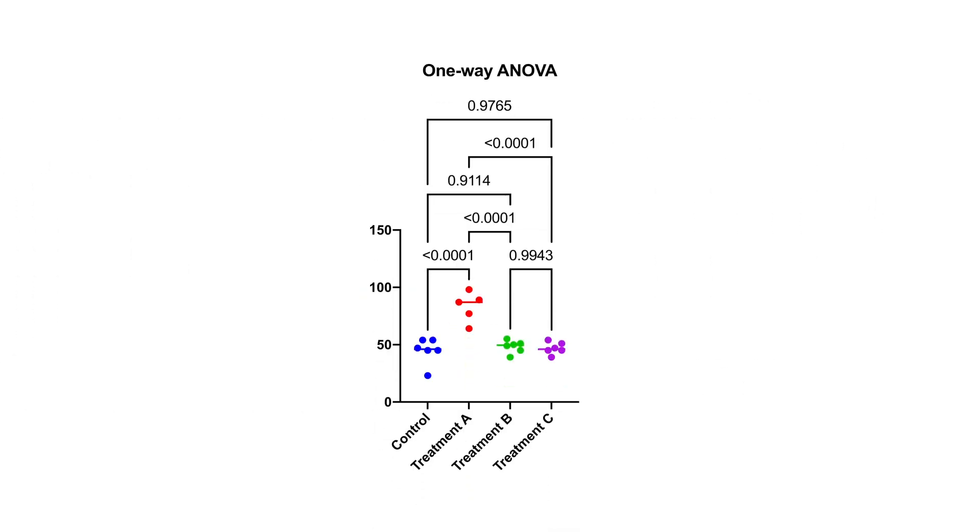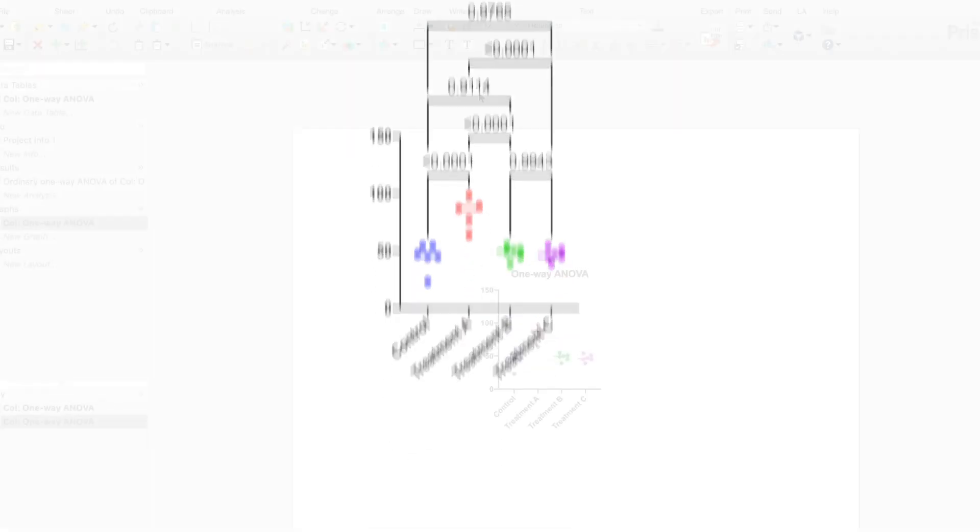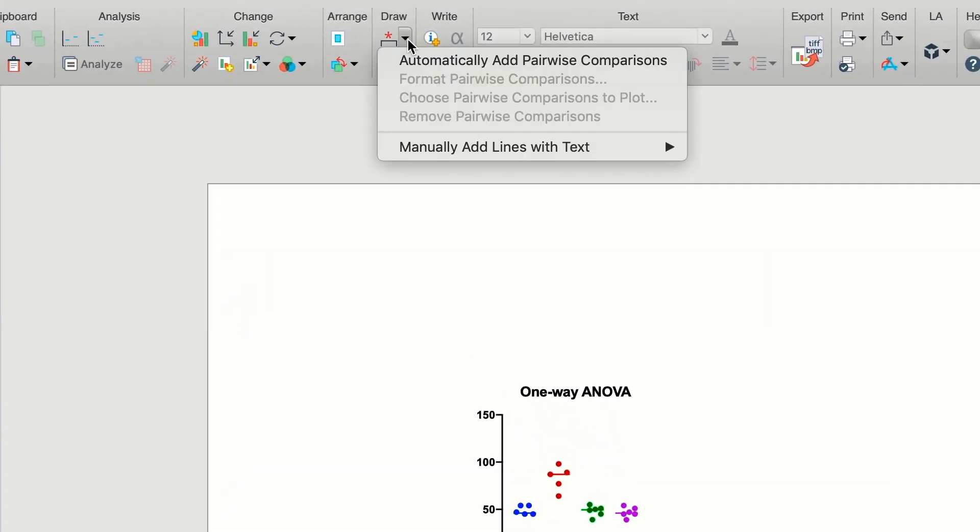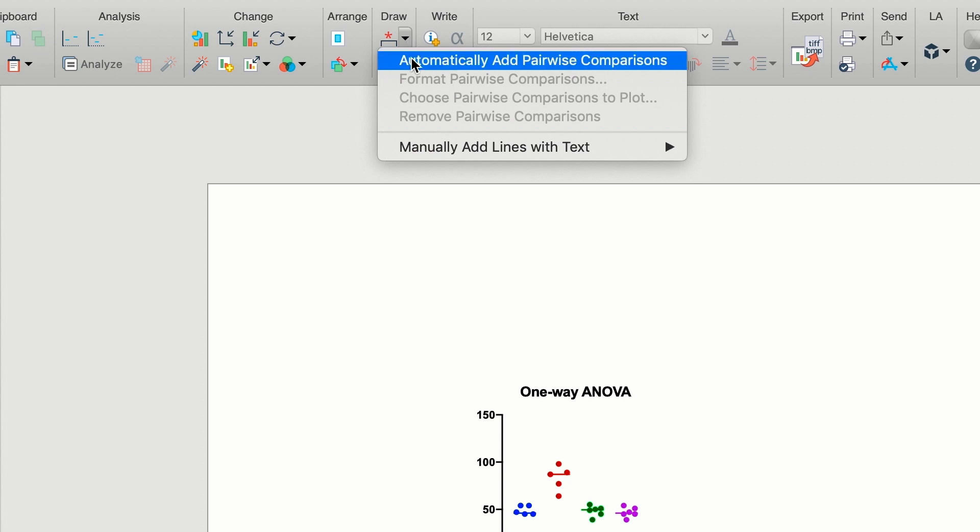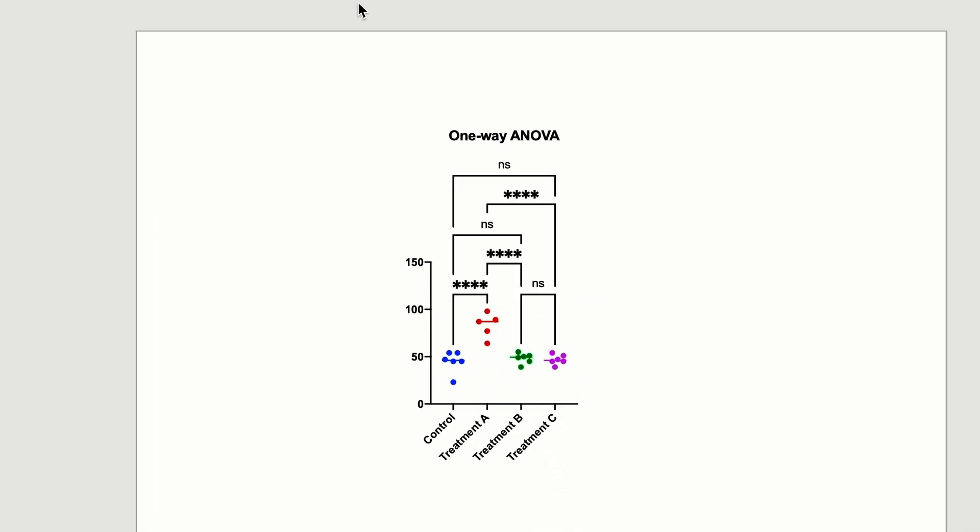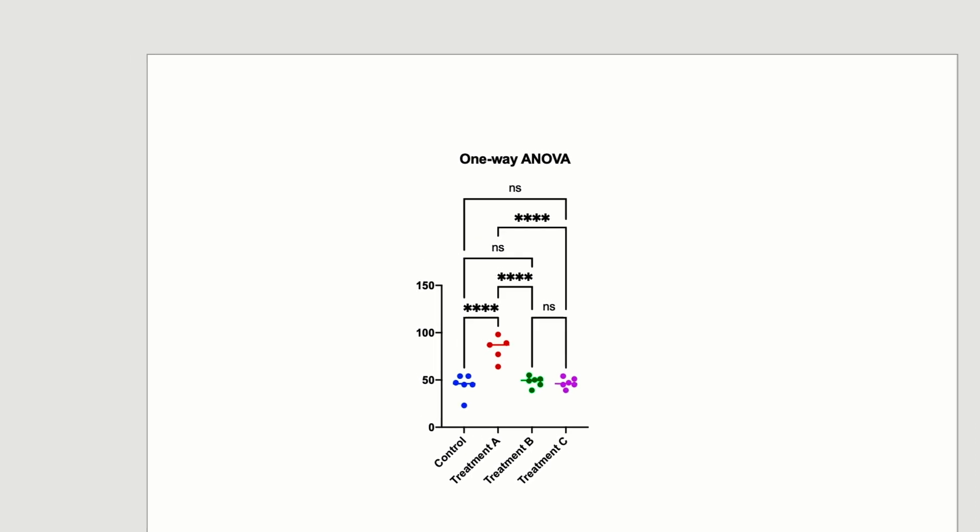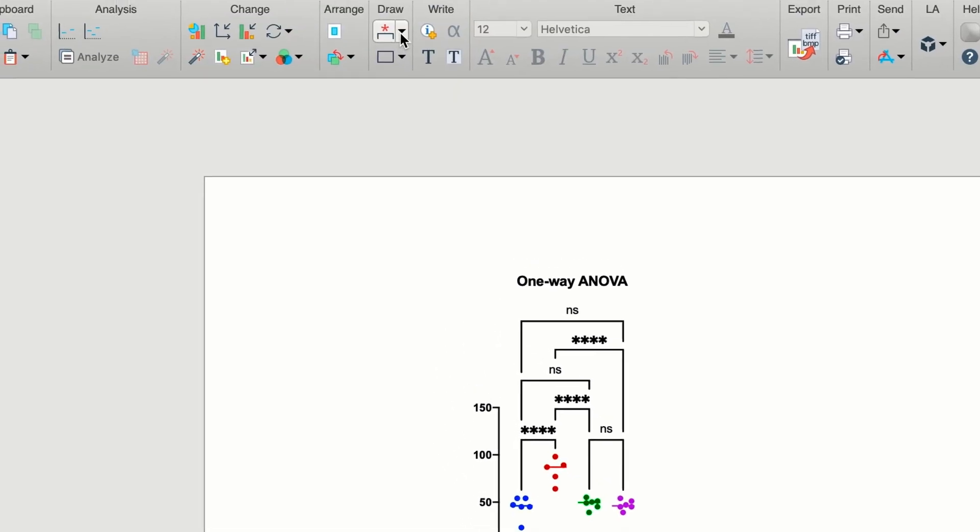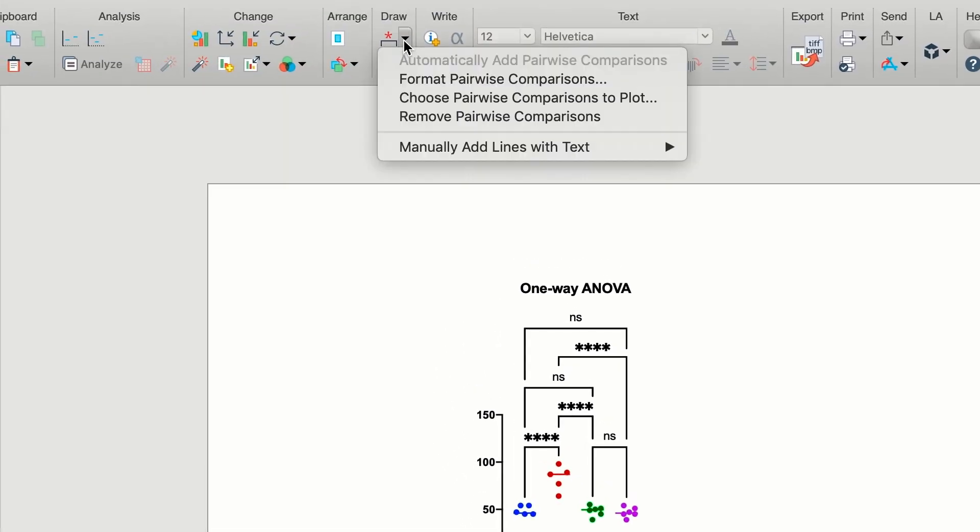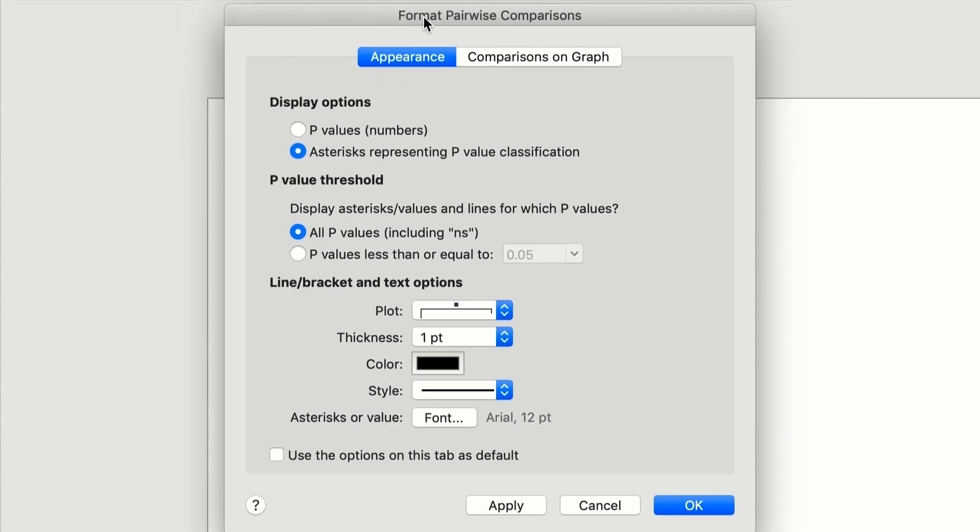Another way to show significance on a graph in Prism 9 is with the all-new automated stars on graph feature. Simply perform an appropriate analysis with multiple comparisons and automatically add these results to the graph with a single click. For customization options of these lines and asterisks, simply click on the toolbar button again and choose Format Pairwise Comparisons.